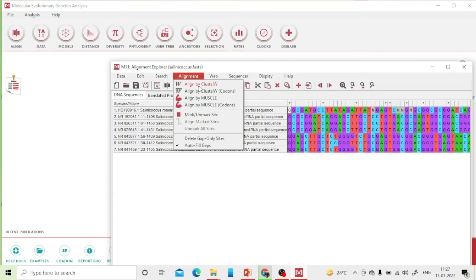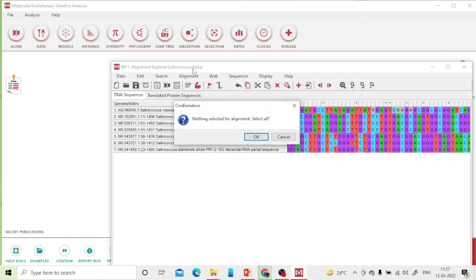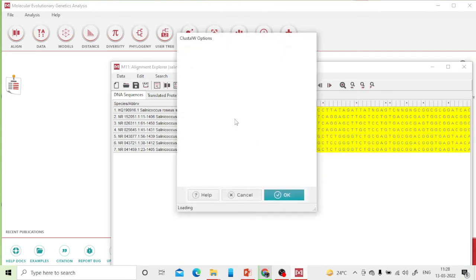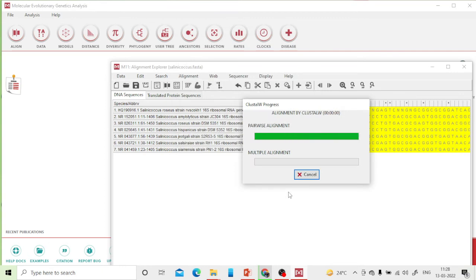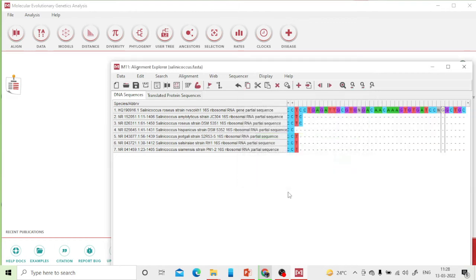Many alignment options are available. I'm choosing ClustalW — you can also choose MUSCLE; both give similar results. Click 'Align by ClustalW'. It will prompt to select all sequences — click yes. Keep all parameters as default and click OK. The calculation time depends on the number of sequences and your processor.